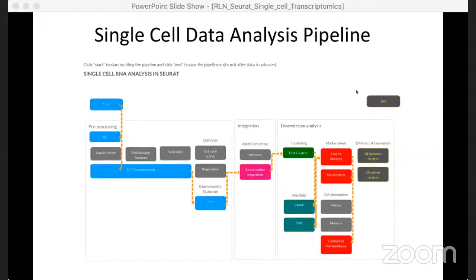After characterizing the sample segregation based on different clusters that we can visualize or identify in our map, we have to assign these clusters to cell types, or annotate these clusters to different cell types based on the marker genes that qualify as significant genes that can differentiate between different clusters. And once we have performed this annotation, we can further, in parallel, perform differential gene expression, identifying differentially expressed genes between clusters or between cell types in our downstream analysis.